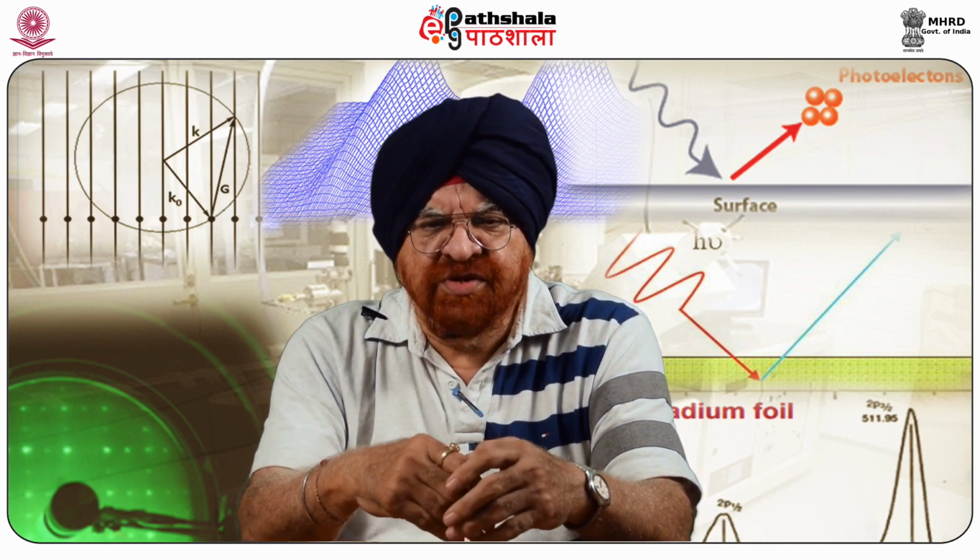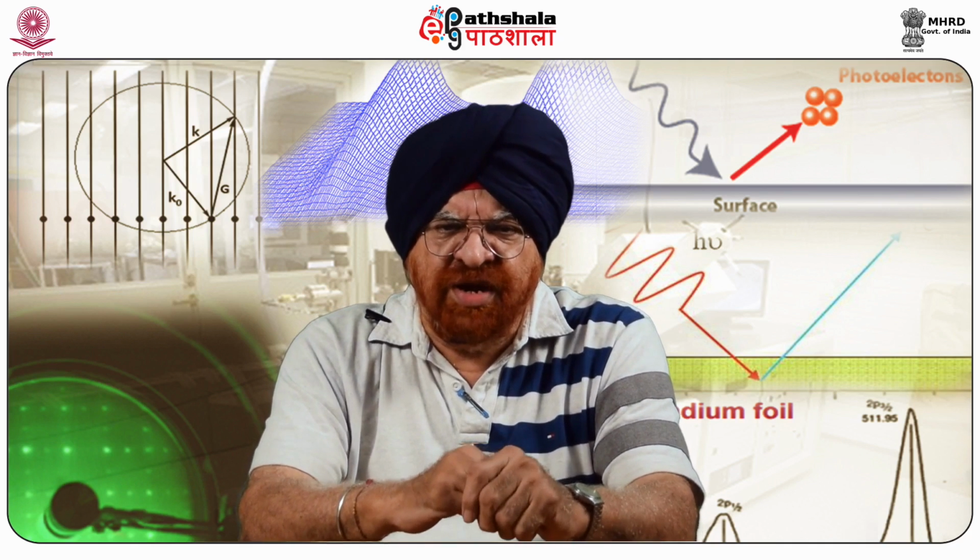Today we are going to discuss the module called Electron Spectroscopy for Chemical Analysis, abbreviated as ESCA. We have already dealt with the introduction and the instrumentation. In this module, we shall talk about data analysis, how this is carried out, and what its importance is. All these factors we shall elaborate in this module. This module comes under the paper of Surface Analytical Techniques, Part 1.